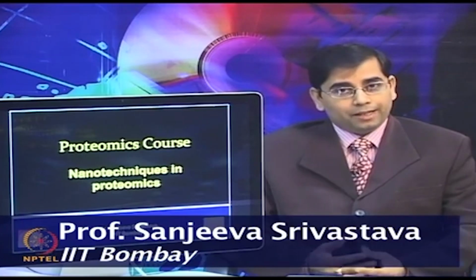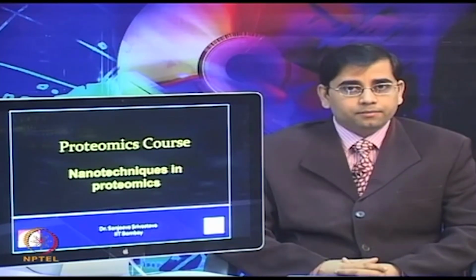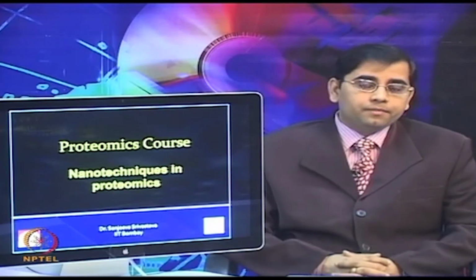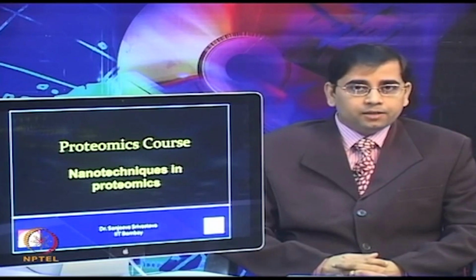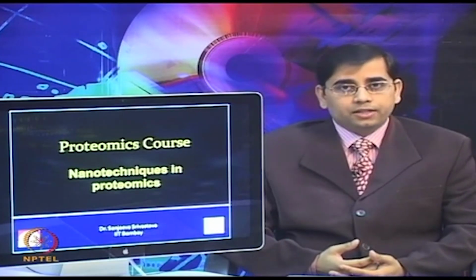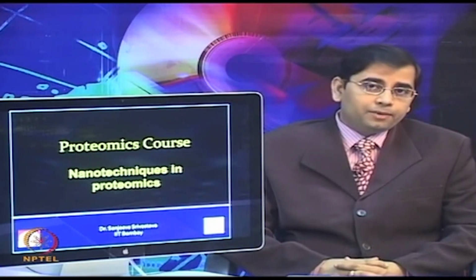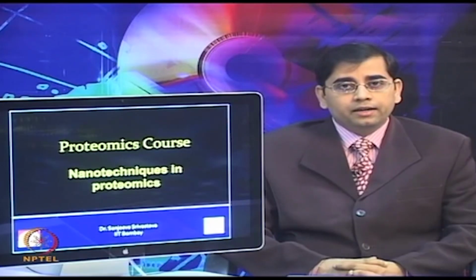We moved on to mass spectrometry, different types of quantitative proteomics by using mass spectrometry. We then discussed microarrays, different types of microarray platforms, including conventional protein microarrays and cell-free expression based protein microarrays. Then we started discussing different types of label-free techniques. In the last few lectures, we focused more on new and different types of label-free methods, such as surface plasmon resonance, surface plasmon resonance imaging, ellipsometry, interferometry and different types of platforms.